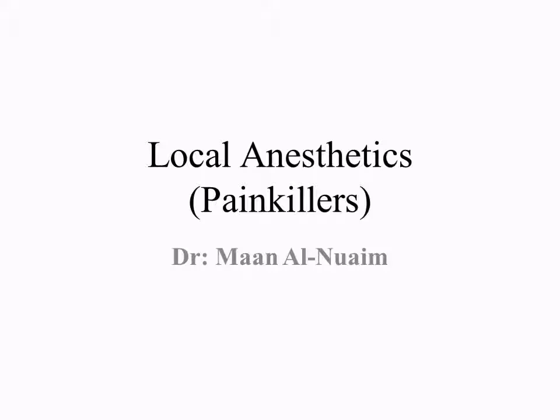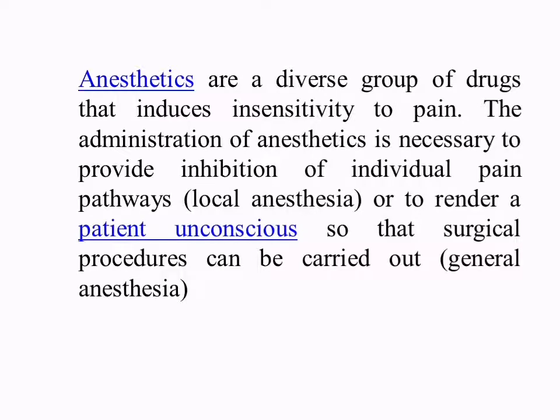Our lecture today is how to prepare local anesthetic. Local anesthetics or painkillers are a diverse group of drugs that induce insensitivity to pain. The administration of anesthetic is necessary to provide inhibition of individual pain pathways or to render a patient unconscious so that surgical procedures can be carried out without pain.